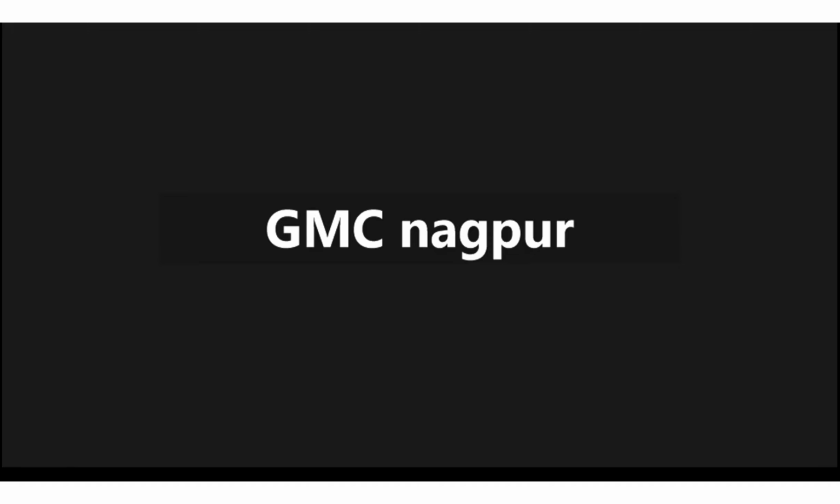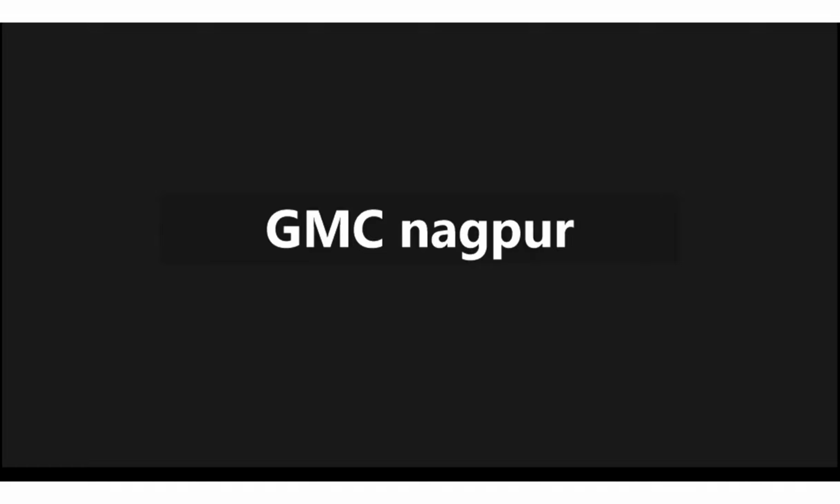Cannot calculate the degranulation of mast cells. So, Madam, can you just unmute yourself and tell us what is the issue there? If there is any issue, we can try to solve that also. Yes, good afternoon, sir. Good afternoon. So after performing the experiment, we have to calculate the degranulated mast cells on the slide. Right. So the slide is very big, so we are not able to calculate the cells.